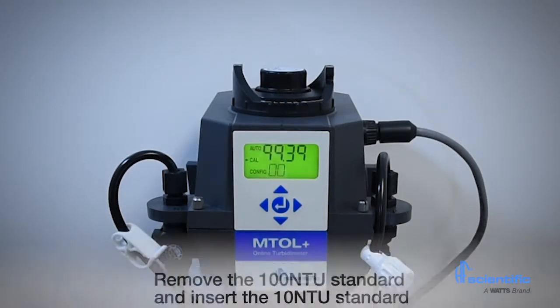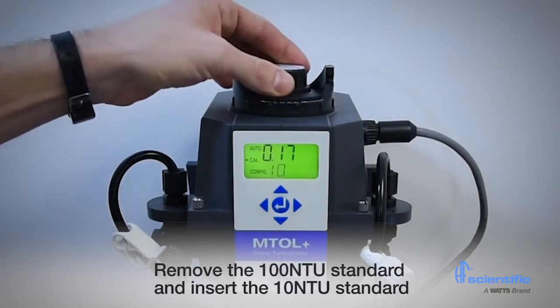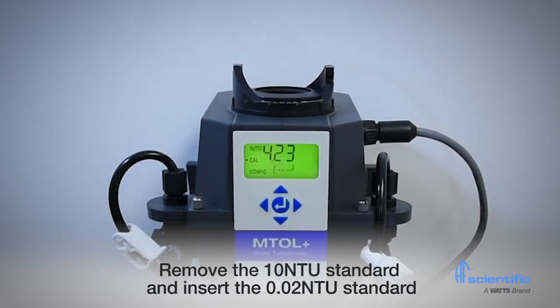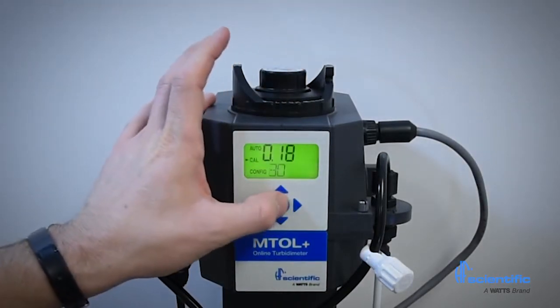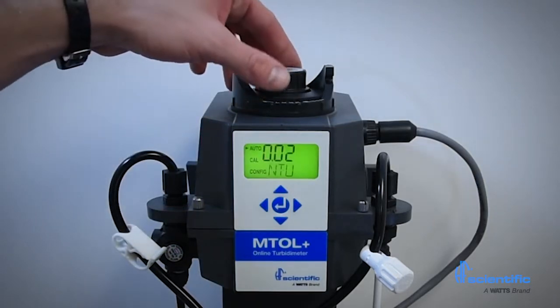Next, remove the 100 NTU standard and insert the 10 NTU standard. Press the center button. The display will count down 60 seconds and then display 0.02. Remove the 10 NTU standard and insert the 0.02 NTU standard. The display will count down 30 seconds. The calibration is now complete. The MTOL Plus will automatically enter the auto mode for routine turbidity measurement.